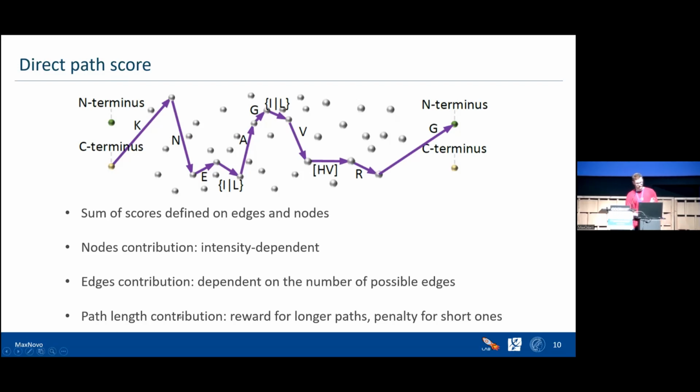And finally, path length contribution is dependent on the path lengths, and it rewards longer pathways as we are interested in complete sequences.